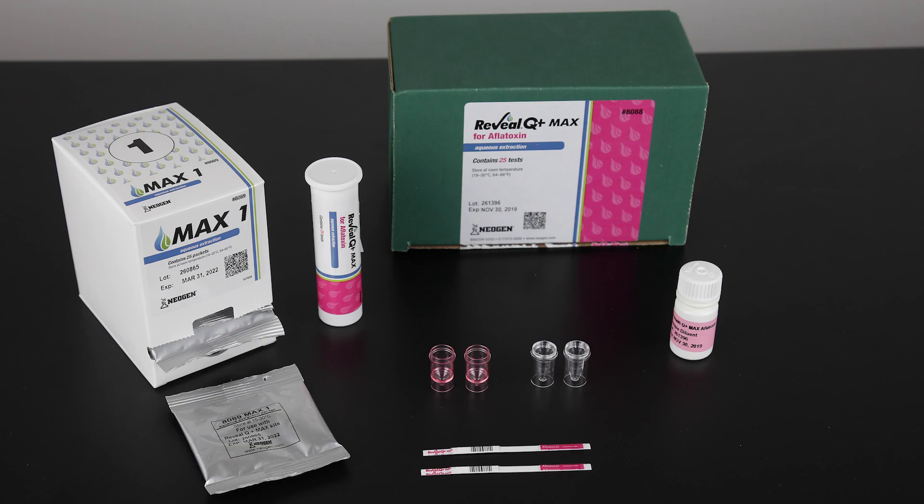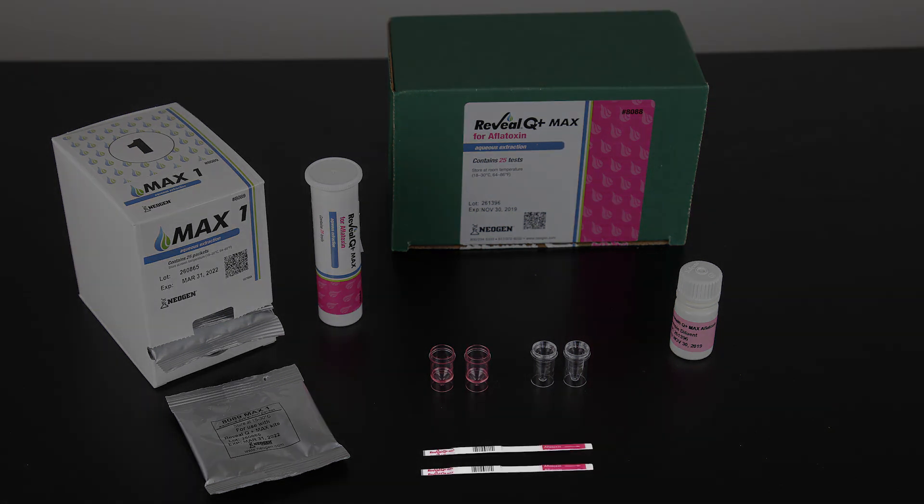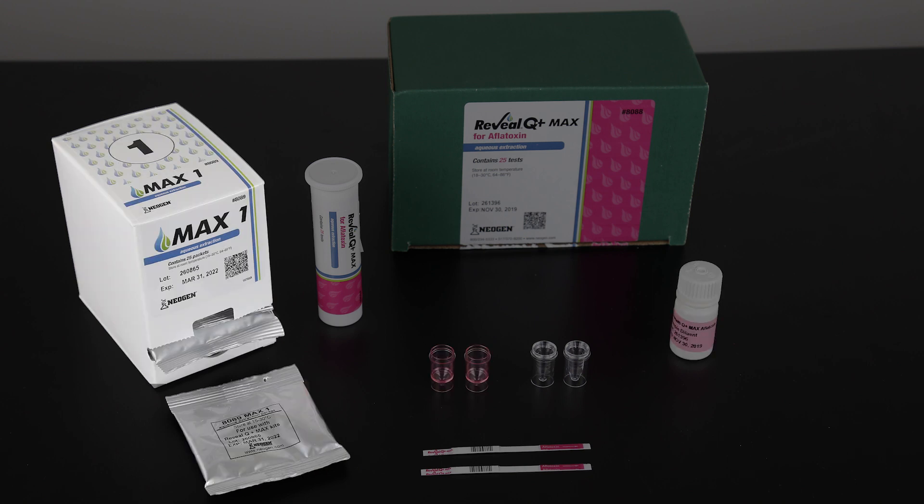Each kit contains supplies to test 25 samples. The kit includes test strips, clear sample cups, red dilution cups, one bottle of sample diluent, and one box of Max 1 aqueous extraction packets.